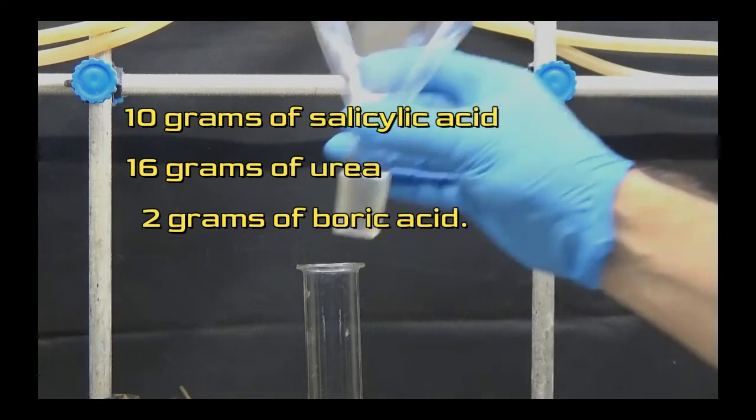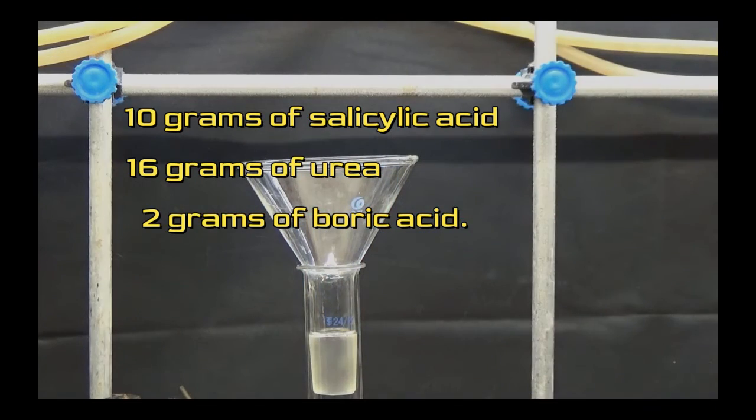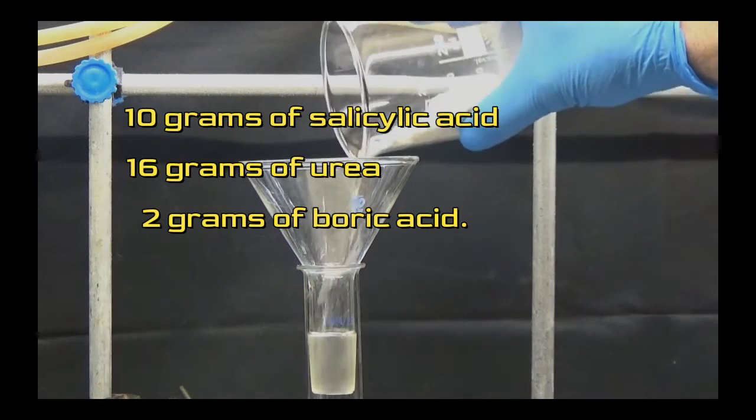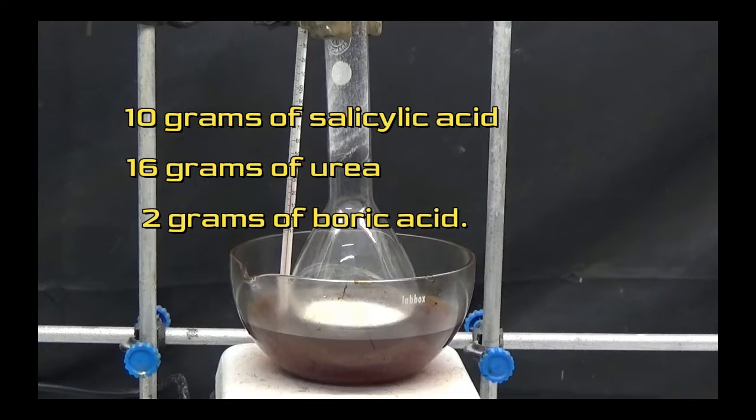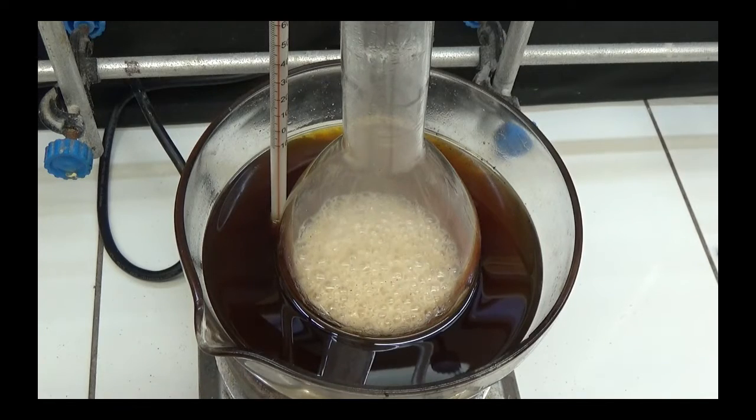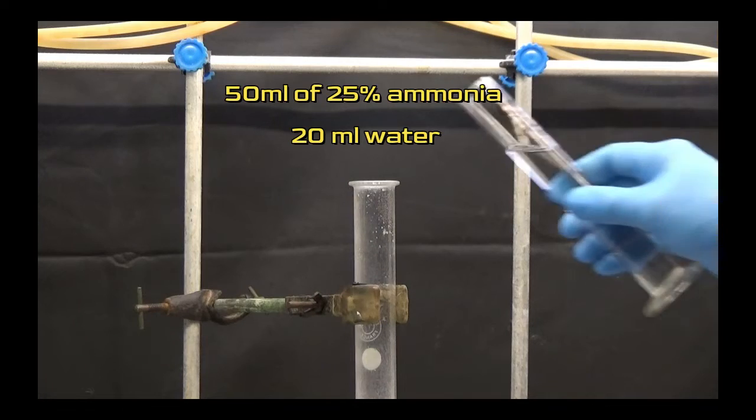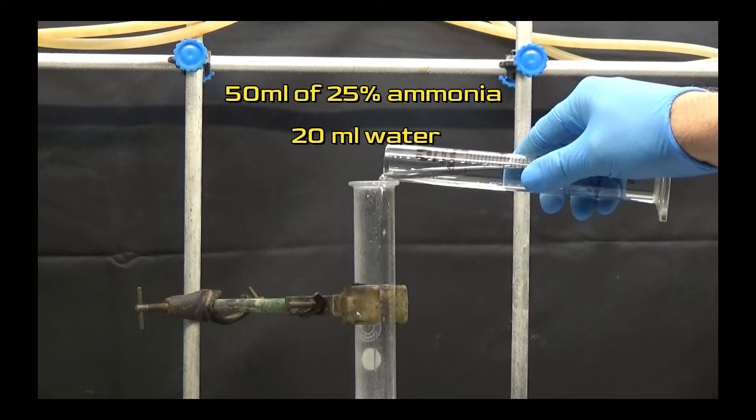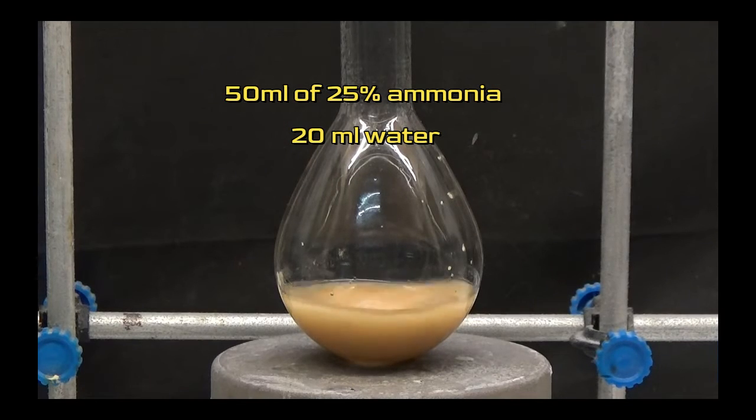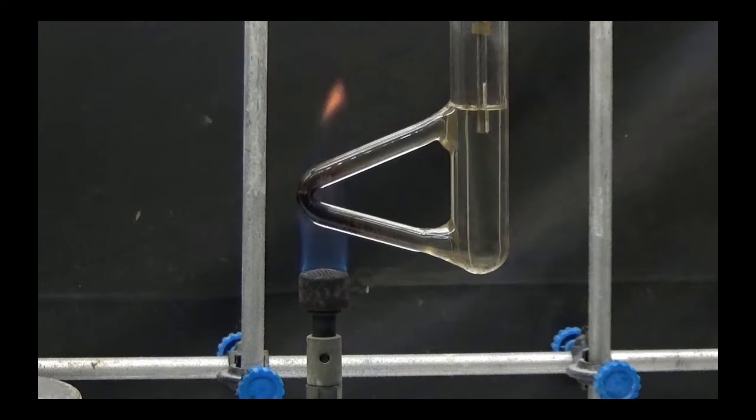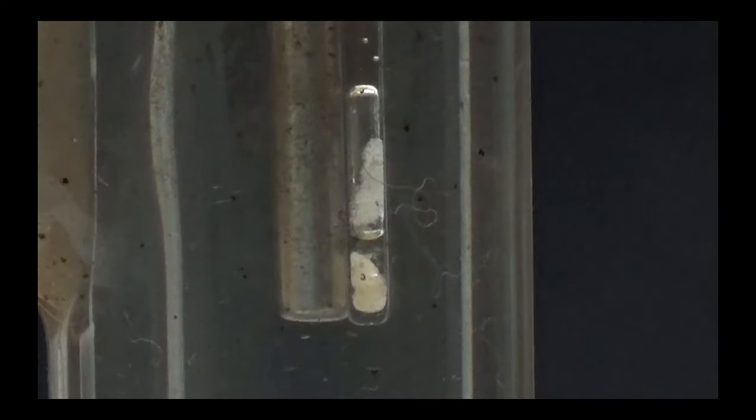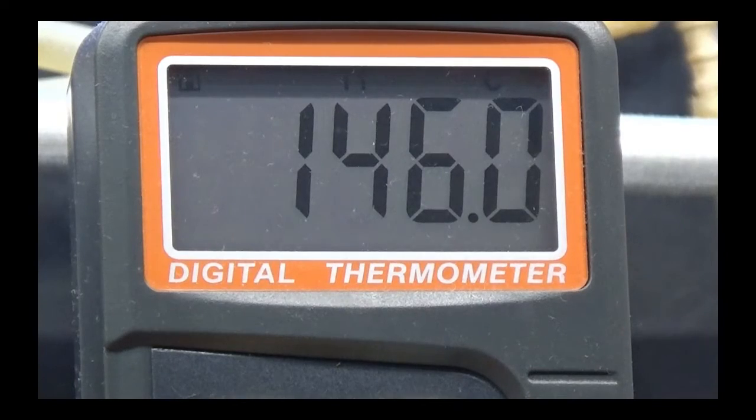In a second identical operation, I reacted 10g of salicylic acid with 16g of urea and 2g of boric acid. I heated it for 2 hours in an oil bath at 180 degrees. After adding the ammonia, I added 20ml of water and boiled it for 30 minutes. It yielded better results and the melting point of the obtained product was closer to 144 degrees.